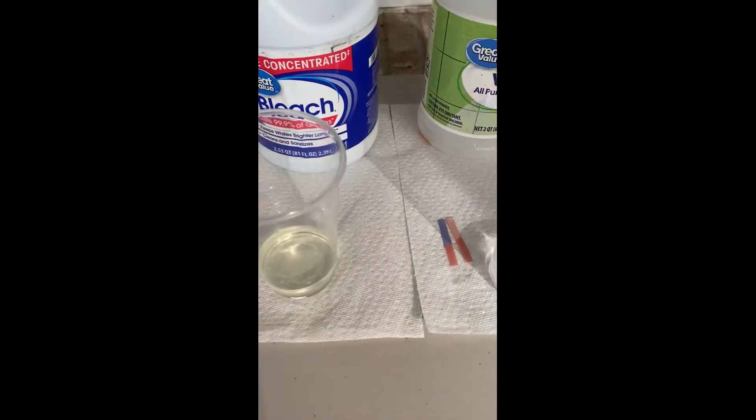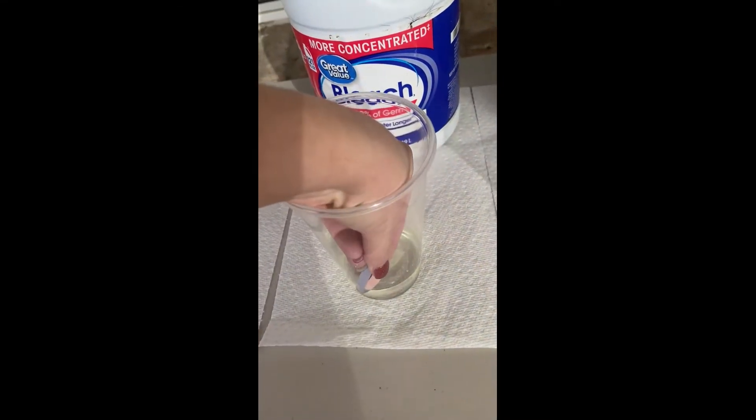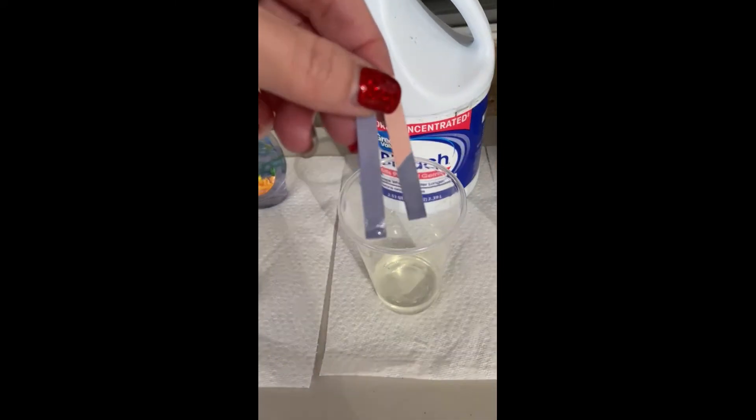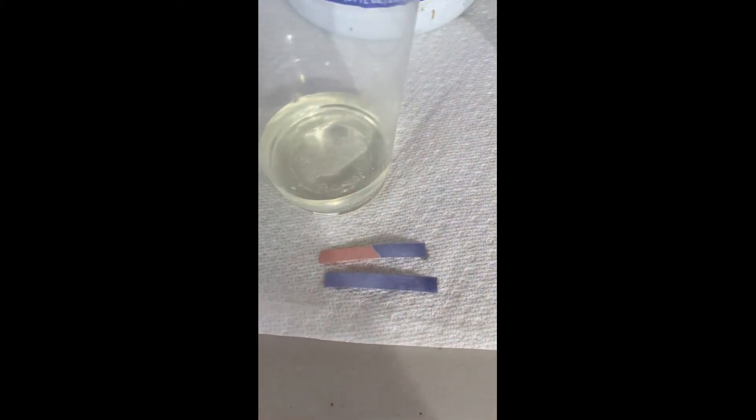Here's bleach. Go ahead and dip your litmus paper. You can see right away that the red litmus paper turns a shockingly bright blue, so this is a very strong base.